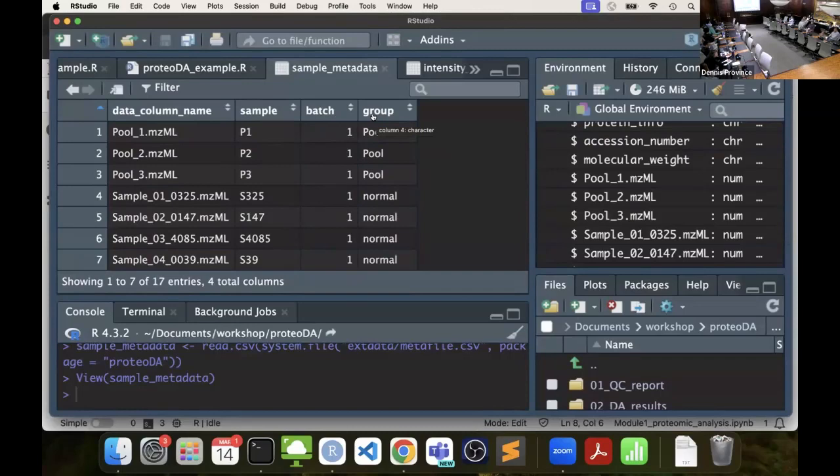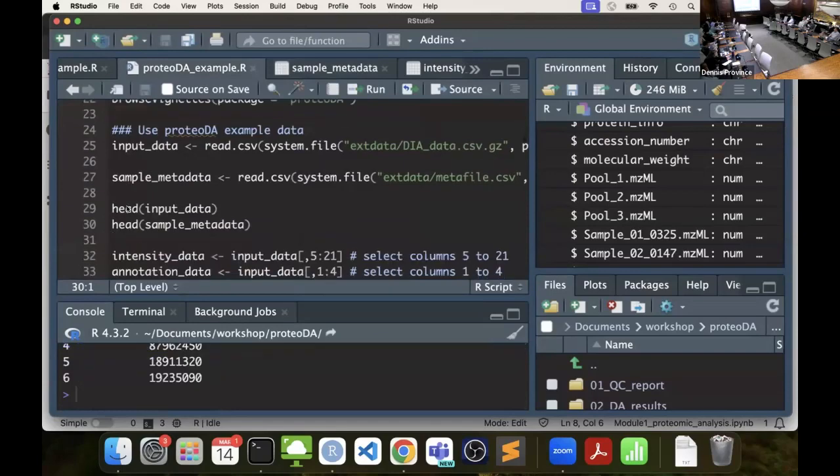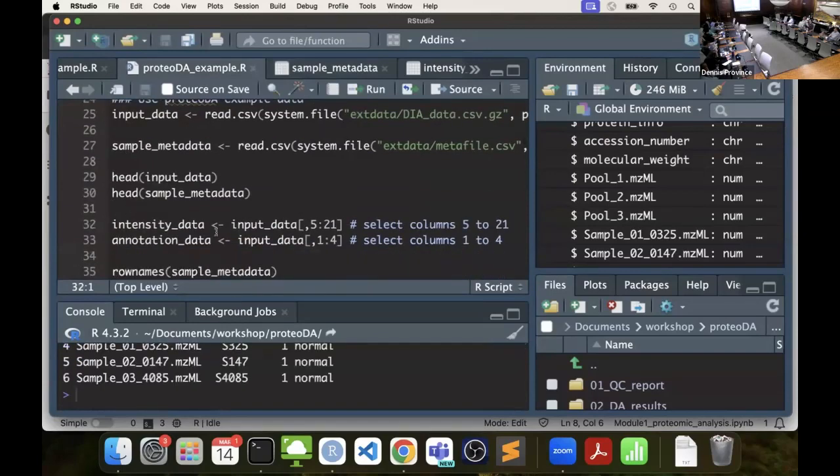And in the code, whether it's capital or lowercase is very specific as well. You've got to make that very specific in your code. So you can change it, you just need to know what you're doing to change it. So, okay, now we have things in here.